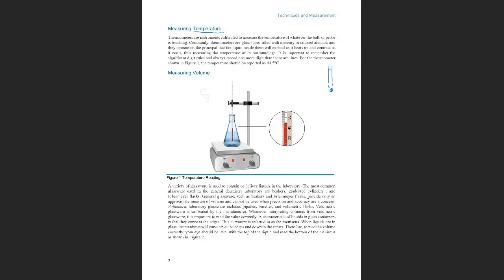So basically, if you put the thermometer in hot water, depending on the temperature, the liquid will expand and show you here. There is a scale in this tube, and you are going to read the temperature that the thermometer is marking. I will assume that not everybody still understands how many digits you need to write when you read a scale. So let's go over that to make sure.